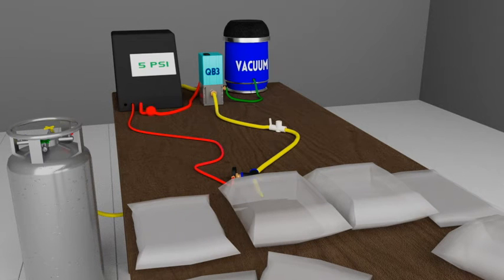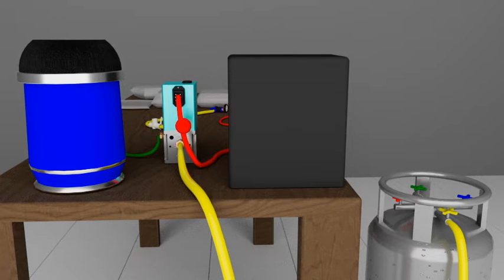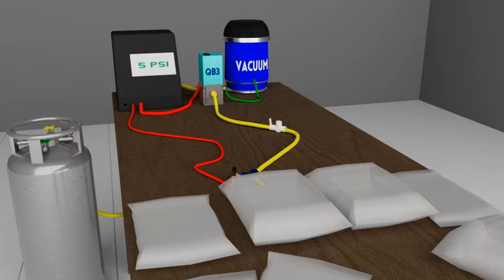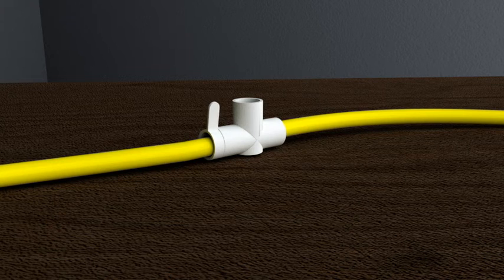First, a signal is sent to the QB3 to command the amount of pressure to be applied to the bags. The regulator applies positive pressure to fill the bag with test gas, and the bag is then isolated by a small valve.